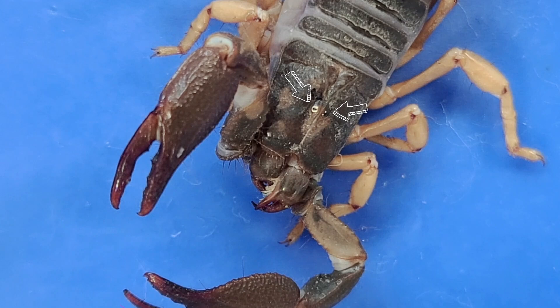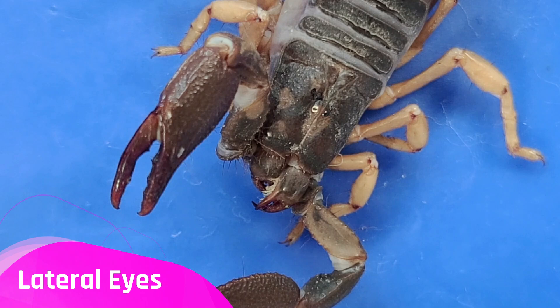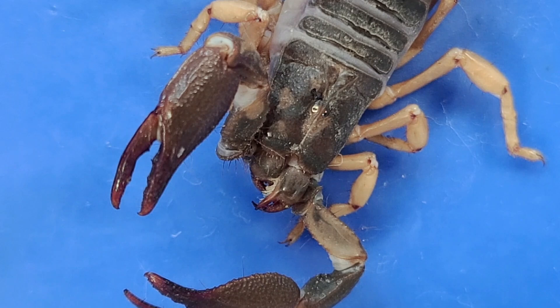Scorpions have several eyes. Two of them are at the top of the head, called the medial eyes. And two to five additional pairs are at both front sides — these are harder to see, but they're called the lateral eyes. Despite their many eyes, scorpions do not have good eyesight. Their eyes can distinguish between light and dark, and maybe movements, but are useless when recognizing shapes. In contrast, their sense of smell is very well developed, and they use it to identify their prey and to detect dangers.